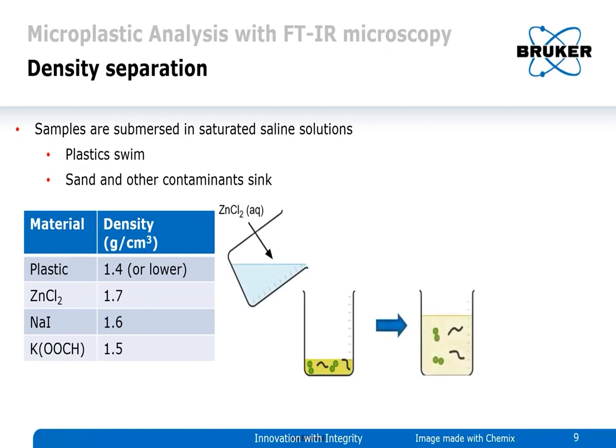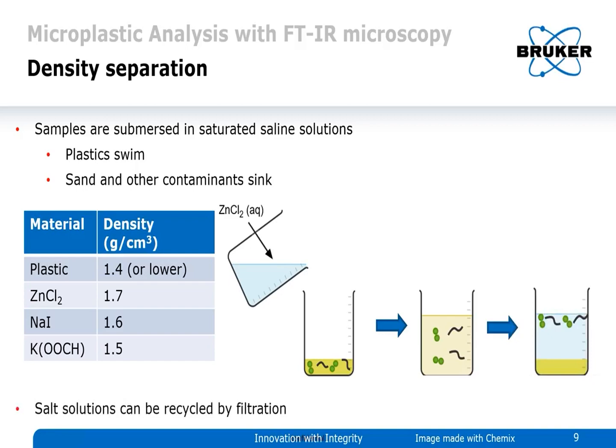And again, you mix your sample, you stir it well, and then in the end the sand will sink to the bottom, the plastics will swim, and you can just pour it off. These salt solutions can be recycled by filtration, so you're not generating a lot of waste by using this method.